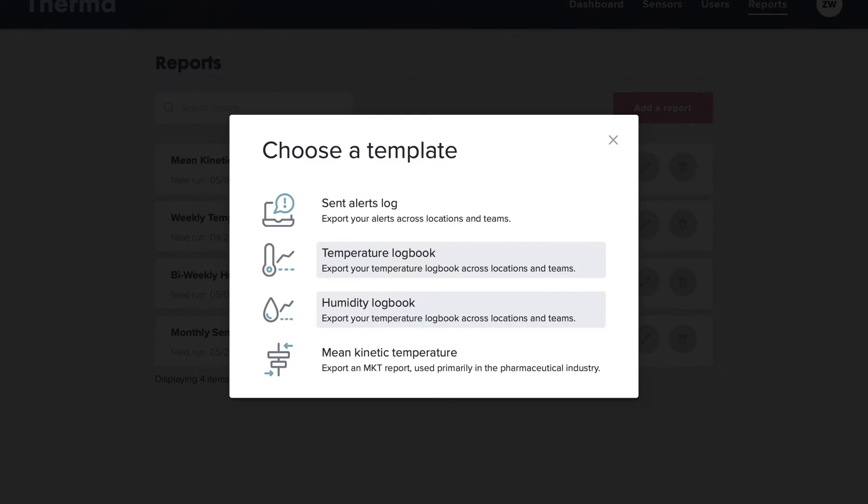The Temperature Logbook and Humidity Logbook display temperature or humidity readings across locations and sensors.